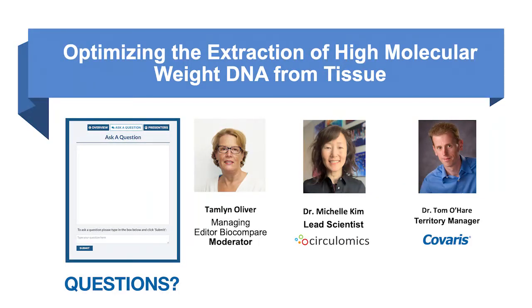All right, here's the next one. How does the cryoPREP work? Vibration, AFA, what else? And how many samples can be treated in parallel? So I guess the best analogy is that it's like a hammer. You put your tissue in a thin plastic bag, and the bag is placed against a solid surface, and then you initiate the impact, and it's metal on metal, and it pulverizes quite quickly.